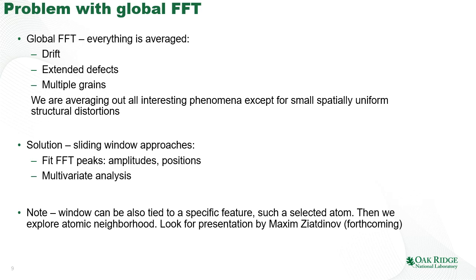The second problem is that when we use the Fourier transform to filter the data in such a way as to leave the physics of interest, this is a procedure that comes with a significant amount of experimental bias. In some sense, we find only the physics that we are looking for. If we filter the image leaving only certain lattice peaks, then all other structural elements, which correspond to different periodicities, will just not be there. So it's a great way to start the image analytics, but maybe not the best way to do in-depth analysis. How are we going to solve this problem?